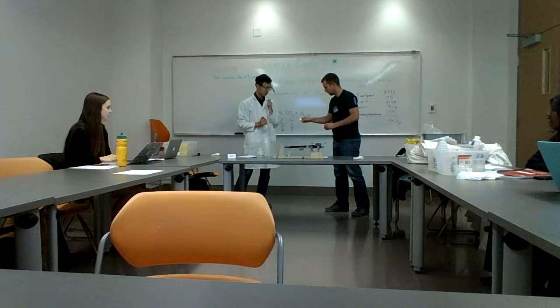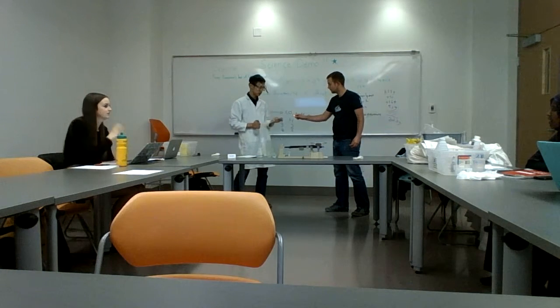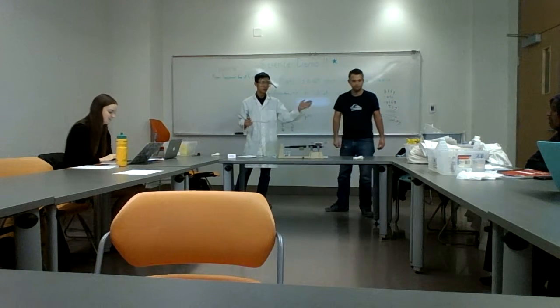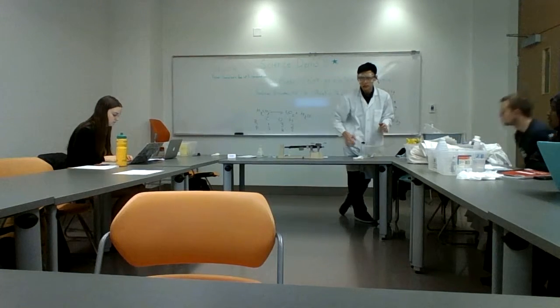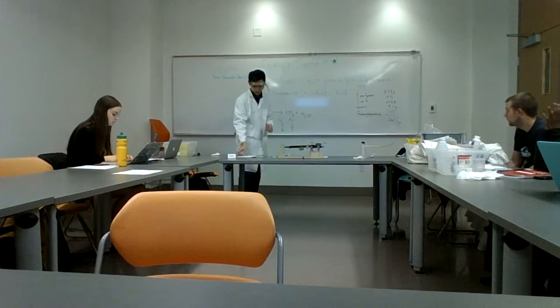So if this is carbon dioxide, it should extinguish the flame now, shouldn't it? Because a flame needs oxygen. Oh, it's slowly dying. Let's just make it last one more time. There you go. So the flame goes out because it is deprived of oxygen, because all of the gas being formed is carbon dioxide.